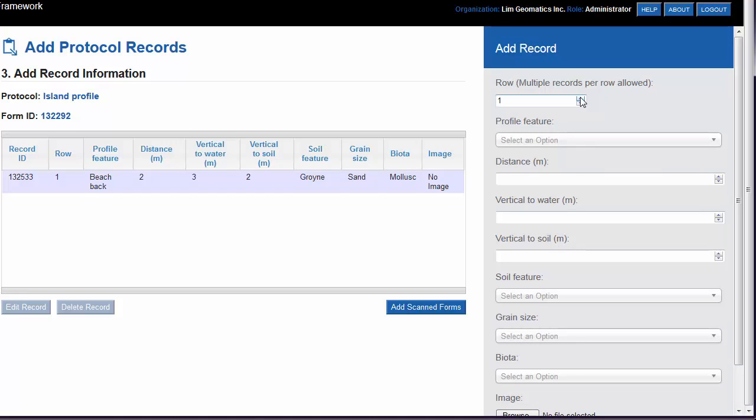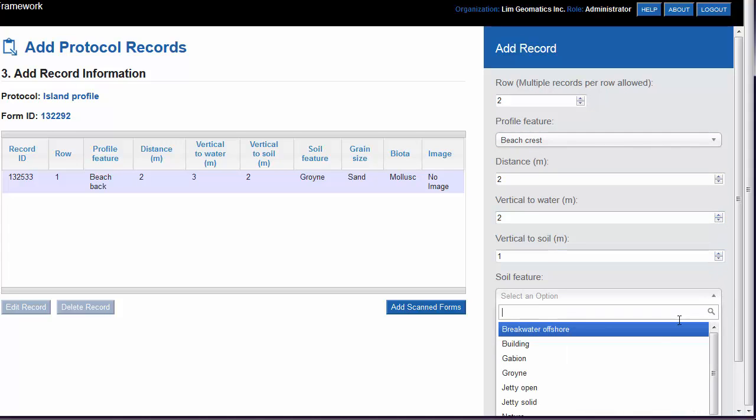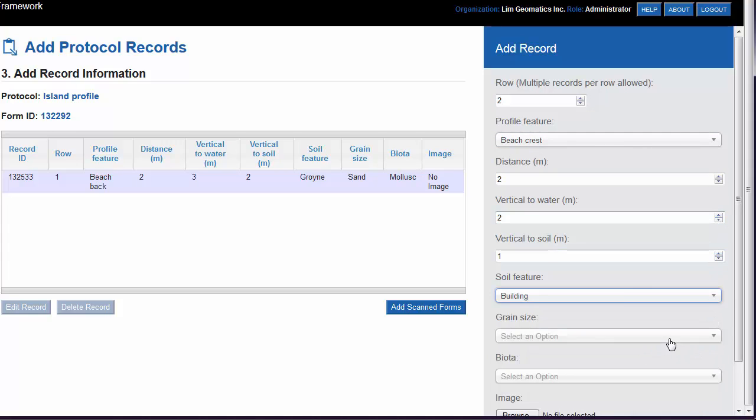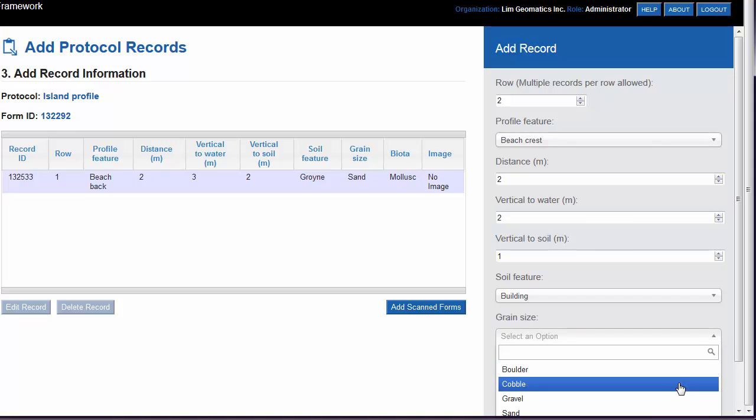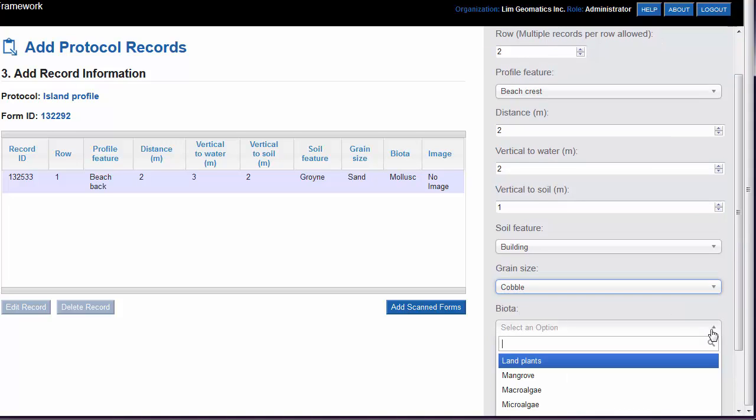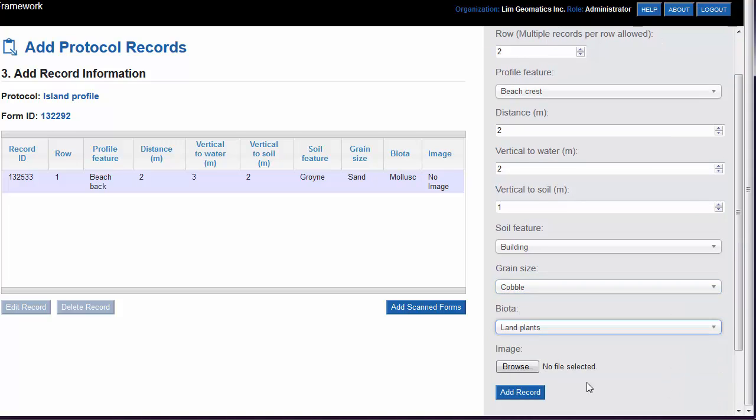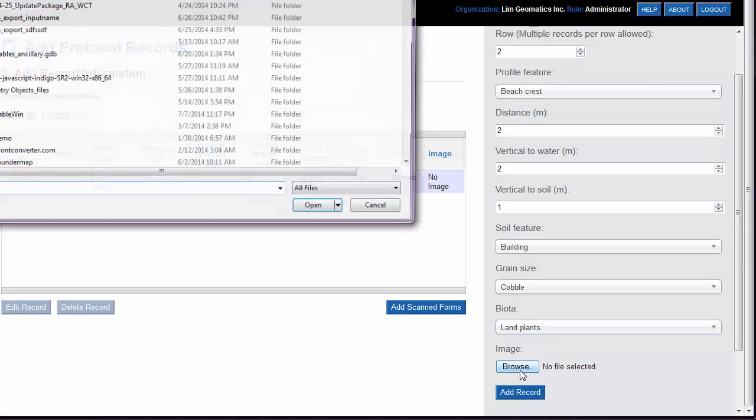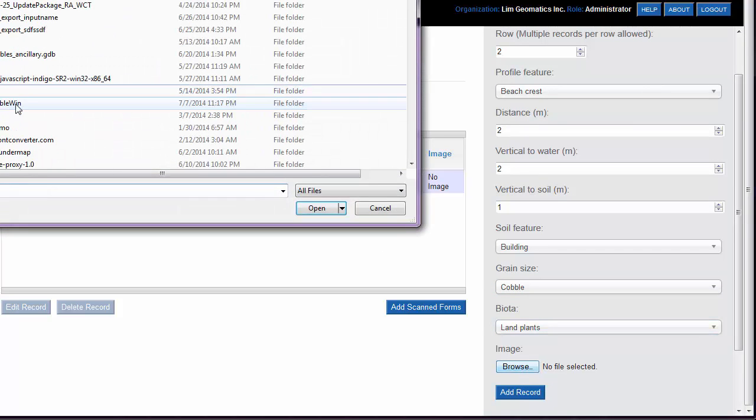We'll add one more record, this time making sure that we select that we want to add it to Row 2. Fill out the information for the new record, and we'll also add an image.